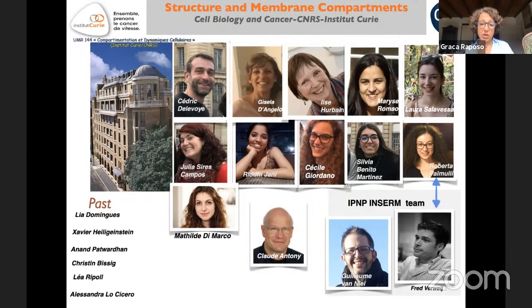I didn't insist much on this part of the protocol. But for cytosolic proteins or proteins that are just linked to the membranes, for example with GPI, for example the prion protein, the situation is different.